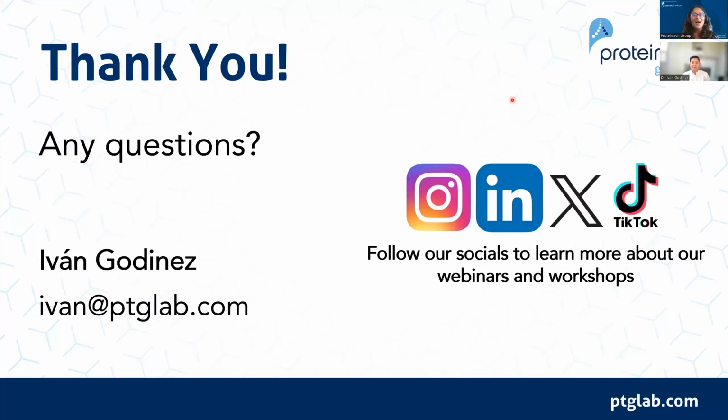Perfect, thanks. There's a question asking, do I need to design custom probes to read out these proteins in the Flex method, or can the oligonucleotides conjugated to the proteins be directly captured by the 10x gel beads? Yeah, you don't have to design any probes. There is an accessory kit you would have to buy with the Flex to ensure that you're getting your feature barcodes read out. But other than that, it's all included. There are oligos that capture the antibodies in that kit if you get that accessory kit, so you don't have to do any probe design or anything like that.